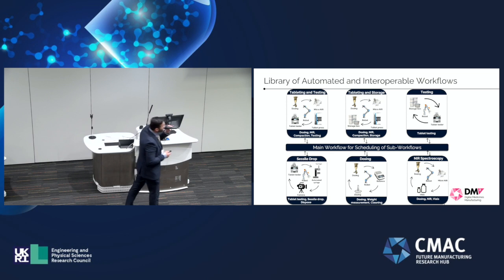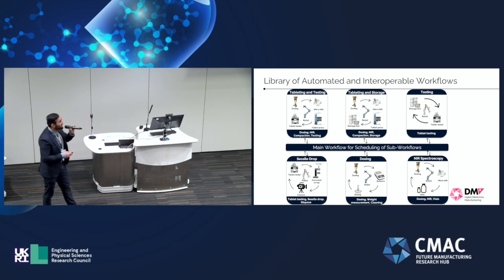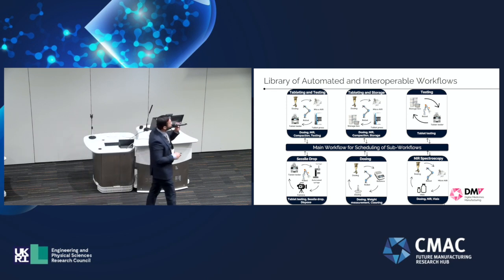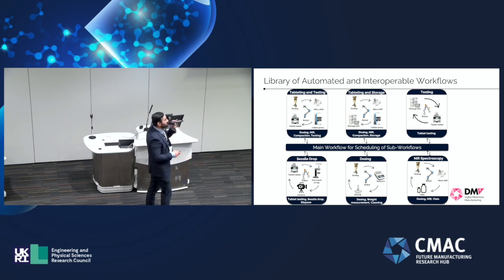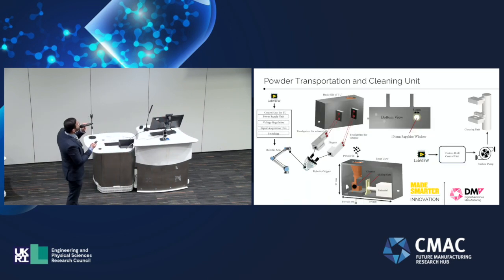One of the successful workflows that we have implemented, and that is working in a fully automated mode, helping one of the PhD researchers, is NIR spectroscopy, where the PhD researcher is using a robotic arm to acquire the dose from the dosing unit, run the NIR spectroscopy on it, and release that sample in a vial for any future testing on it using HPLC.